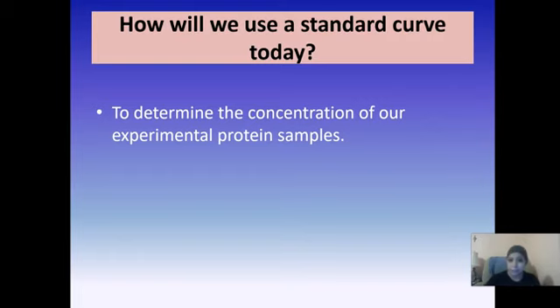Our knowns are going to be, if we are looking at a protein sample, obviously then we need a standard curve prepared with purified protein sample. If we are looking at the concentration of a different thing, not protein, but maybe a chemical, then we would need our knowns to be standards that are dilutions of that particular substance.